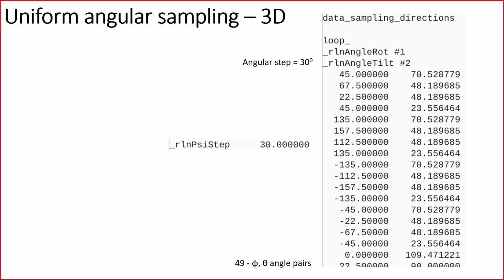These are the combinations, and we have 49 combinations of these angle pairs. Plus, we have the in-plane rotation using the psi angle, which has the classic 30-degree step.